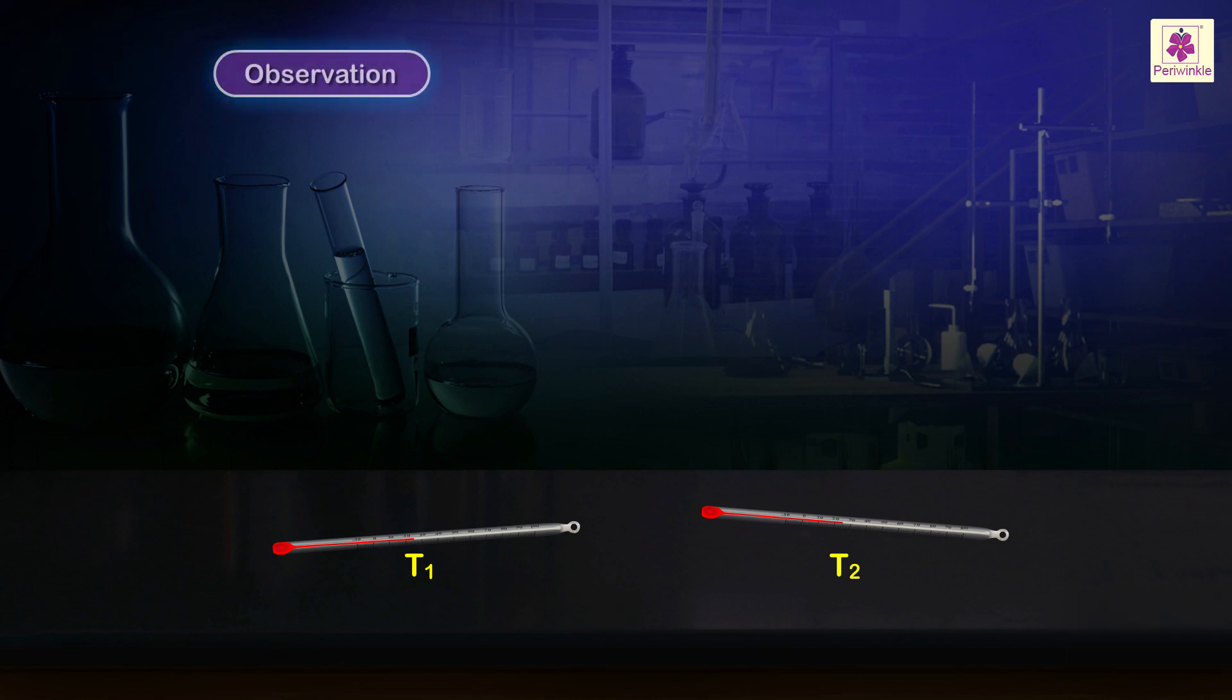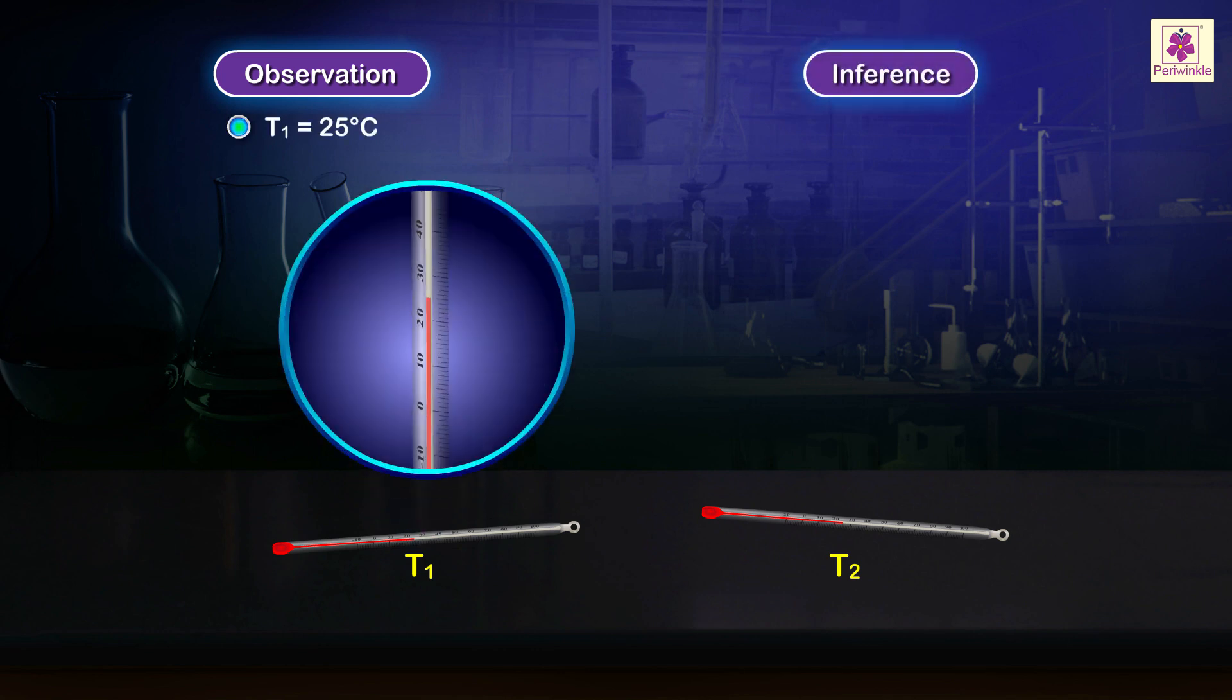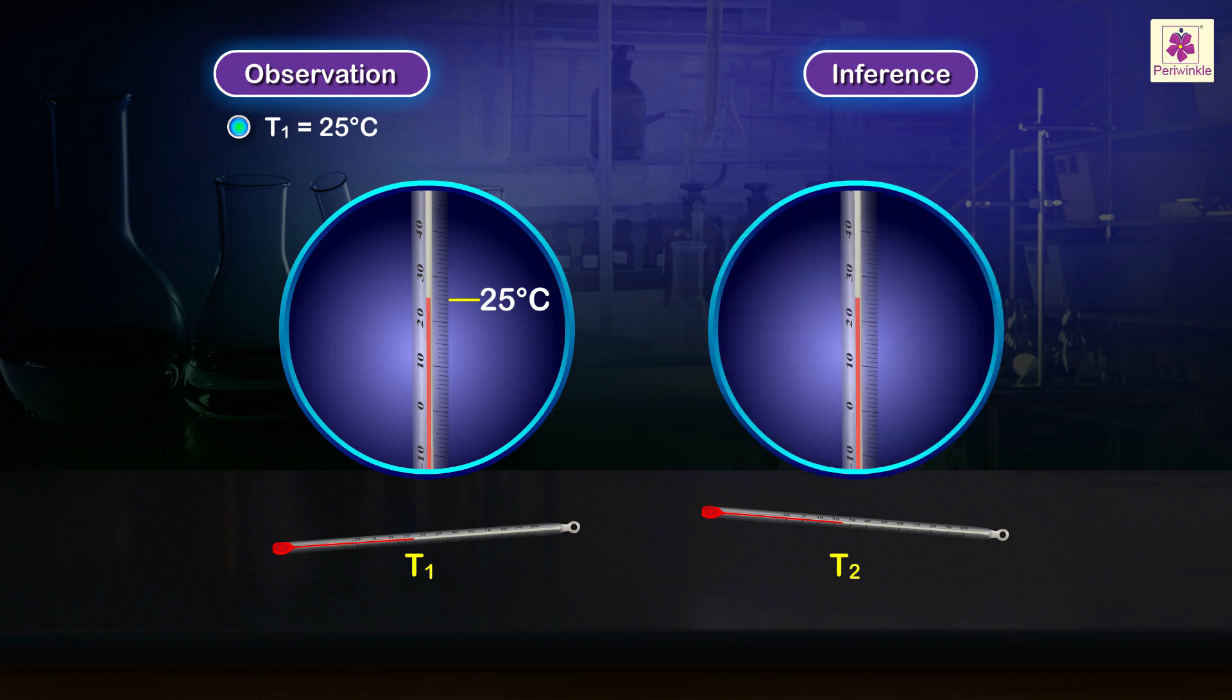Observation: T1 equals 25 degrees Celsius. T2 equals 25 degrees Celsius. Inference: The thermometers show the air temperature in the lab.